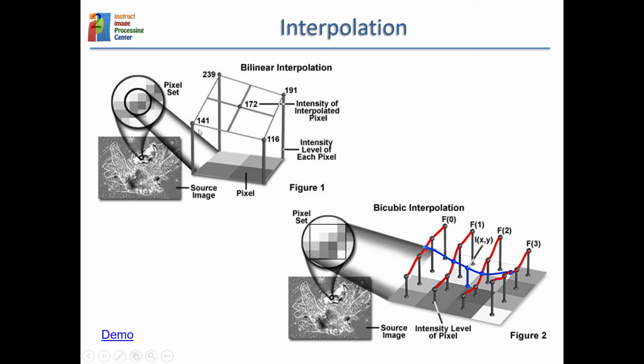The 4 pixels around just give you an idea, you can construct just a continuous function that is compatible with those observations. But if you take more information around, you are able to construct a function that is not only continuous and compatible with the observed values, but whose derivatives are also compatible with the derivatives you have observed. And again, you cannot be restricted to 16.